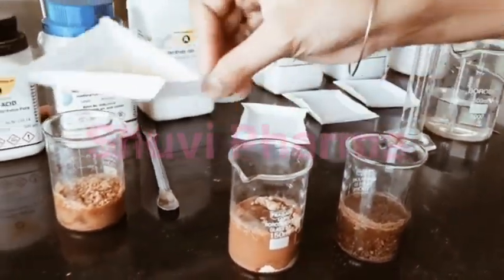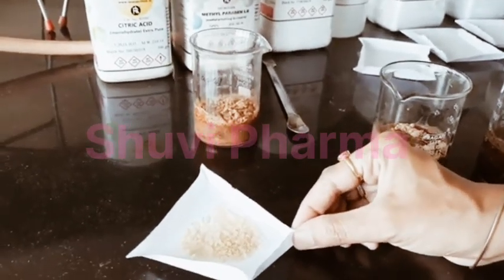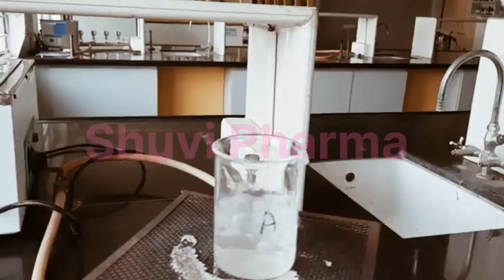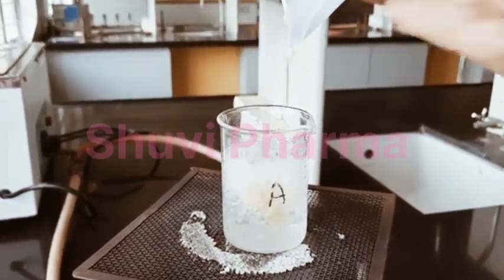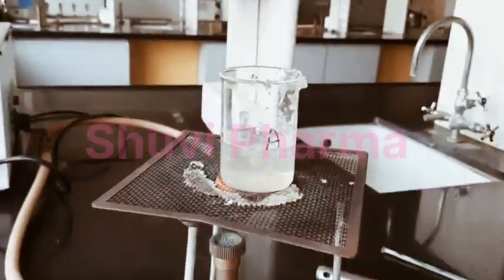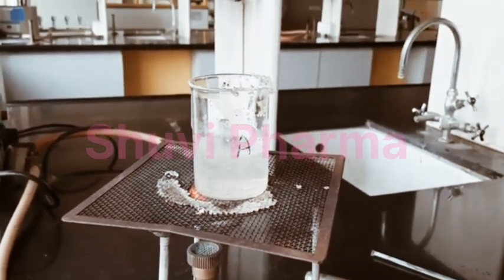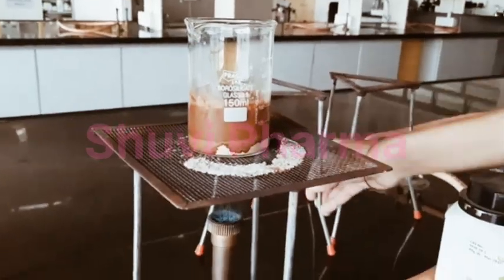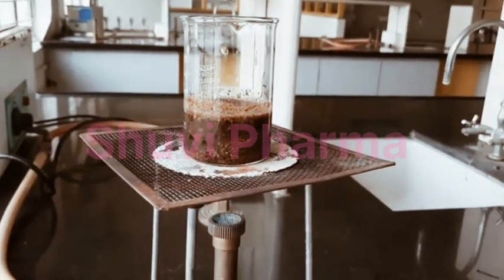And for preparation of gelatin solution, 1 gram of gelatin is taken and we will add this gelatin to boiled 50 ml of water. So as you can see here, the water is boiled. To this we will add 1 gram of gelatin, and we will keep this for boiling for some time so that the gelatin solution will be prepared. So this is shikakai extract and this is amla extract. We will boil this extract.